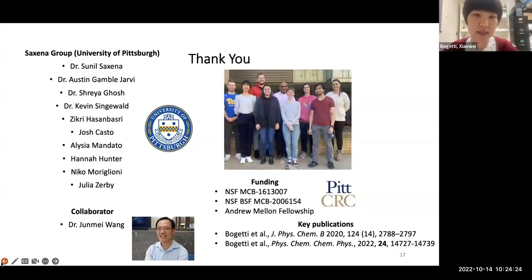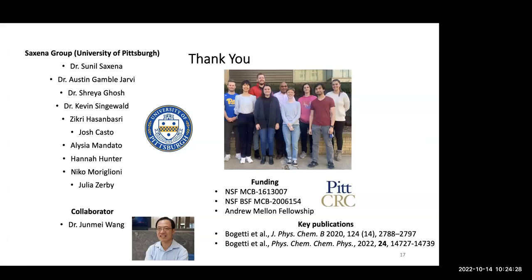Oh, I think there is a question. Hello. My name is Graham Smith from St Andrews. So very nice talk. I enjoyed that lots. A long time ago, we also did similar things on nitroxides, looking at orientation. If I'm remembering rightly, our conclusion was that in your measurement you're just correlating two parallel orientations at three different fields. And my question is, is that really sufficient? I always thought you needed to also correlate orientations at different field positions. In other words, do your DEER experiment pumping and probing at your three different points. But are you saying that effectively that's not required? If you understand my question.